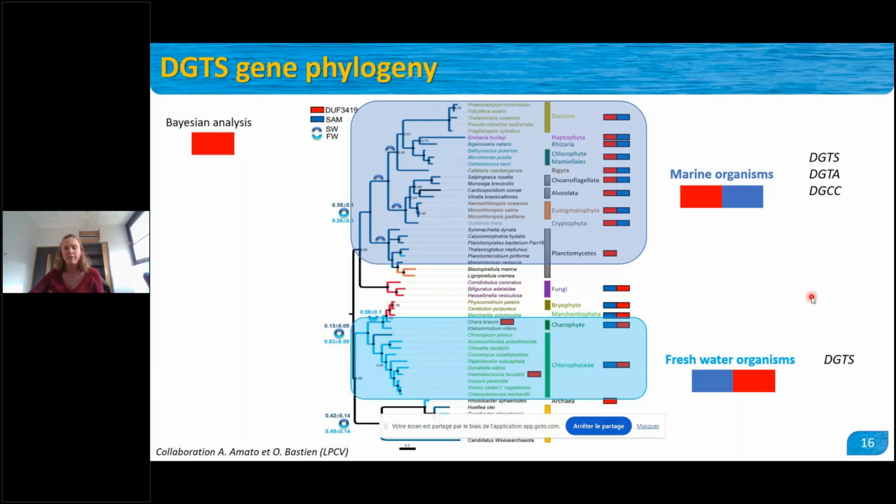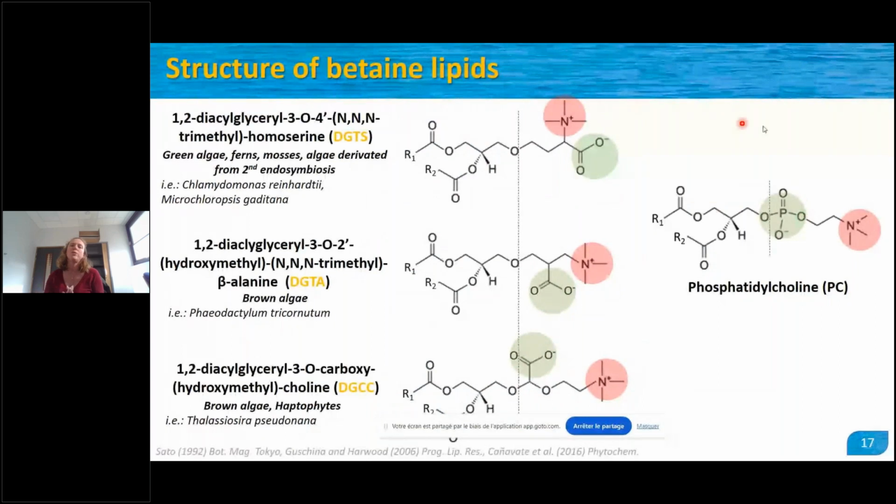So why is that? We tried to do some biophysics. We are in Grenoble, quite close to the Institut Laue-Langevin, ILL, which is a neutron-producing reactor. So we did some neutron diffraction.